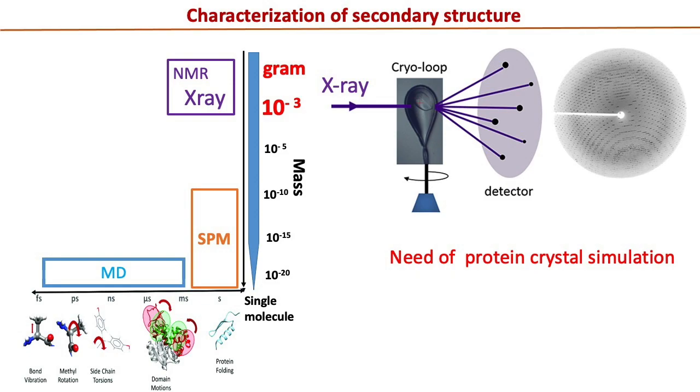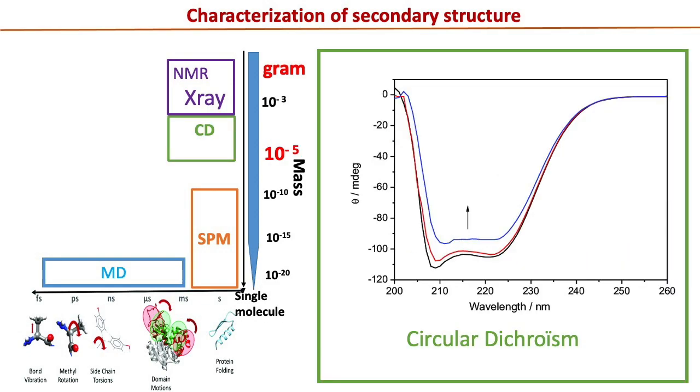in aqueous solution. Optical spectroscopy, such as circular dichroism in the UV range, has been developed to require relatively smaller amounts of sample under physiological conditions. This has resulted in its widespread use by the communities in biochemistry, structural biology, and pharmacy. However, the UV spectrum provides limited resolution on structural information. A spectrum needs fitting procedures and deconvolutions.